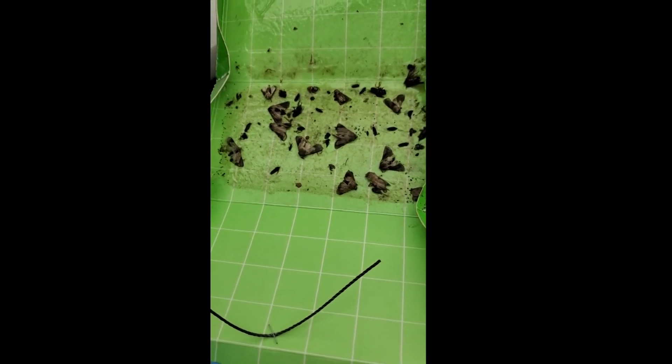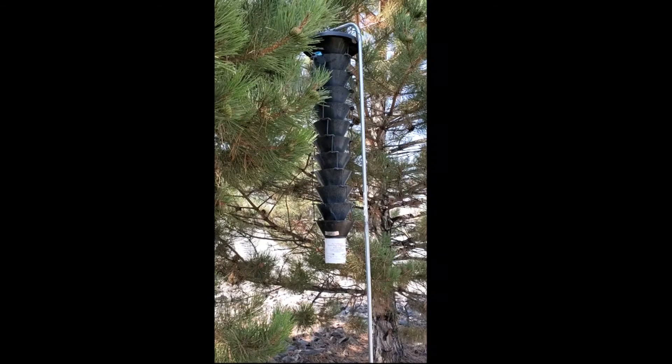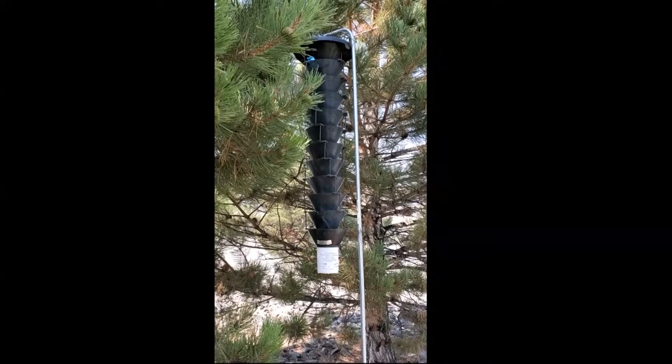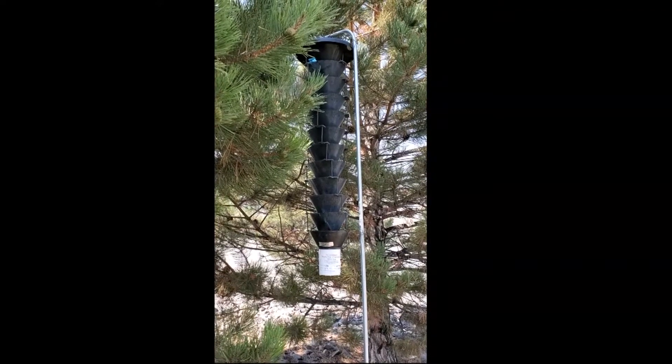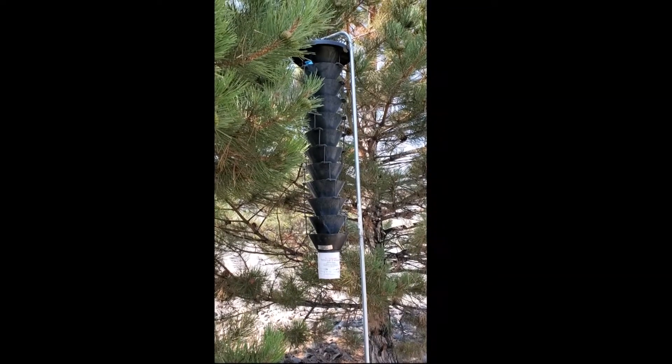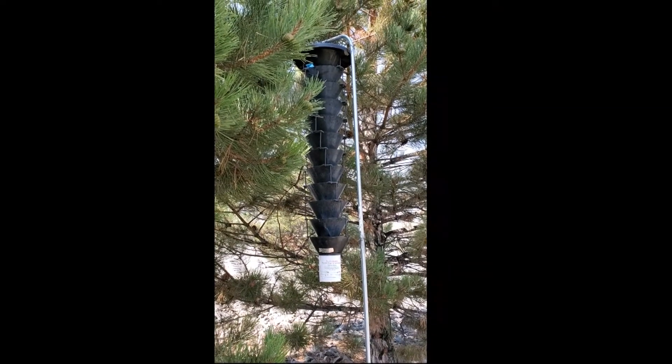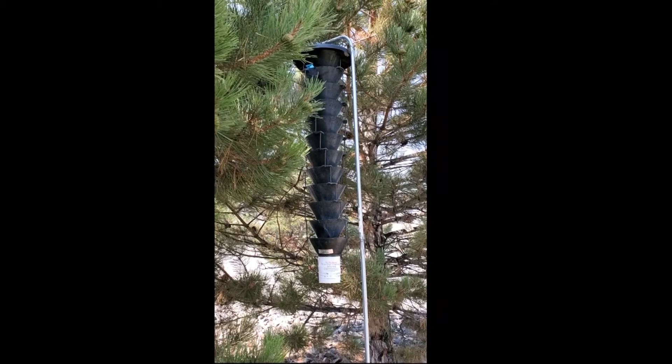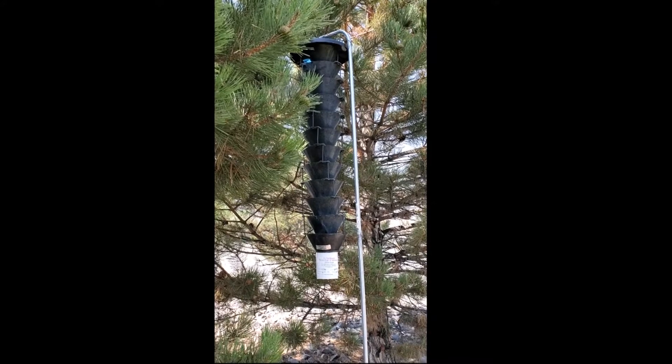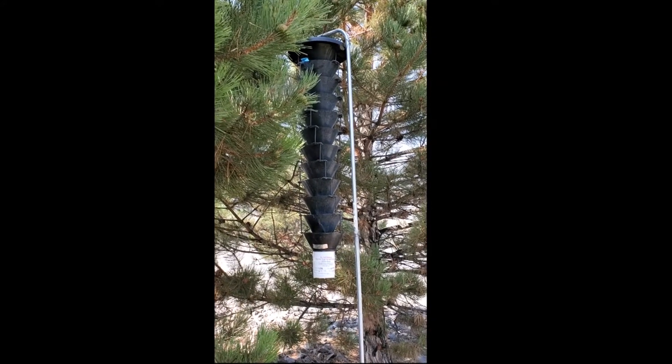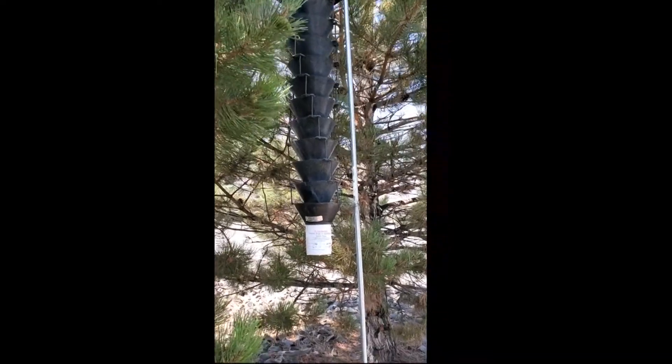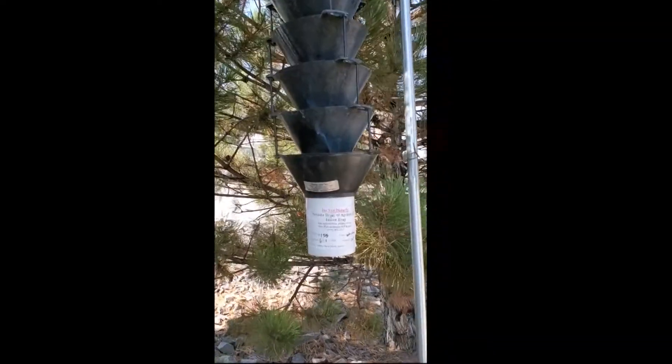This is an exotic woodbore trap or bark beetle trap. These traps kind of look like a trunk of a tree. We then put various chemicals or lures on the trap. You can see the little blue bag up at the top. These attract the insects. The insects then fly in, hit the funnels and fly down to the collection cup at the bottom.